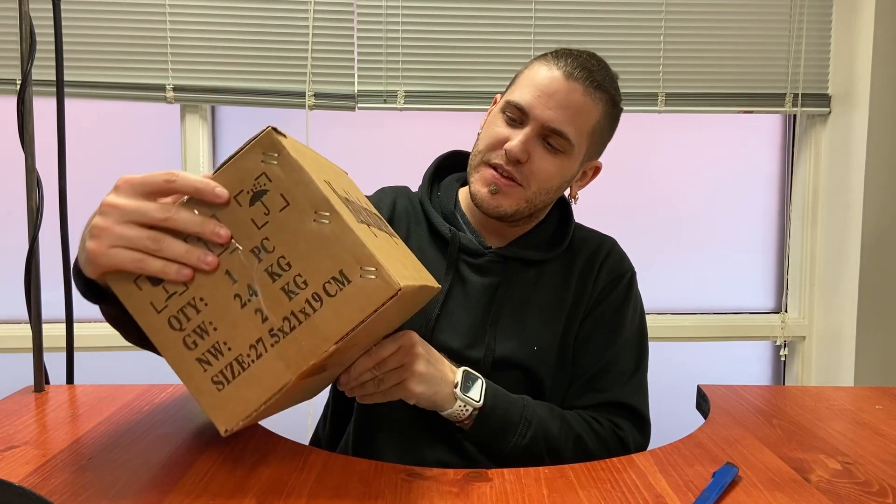Hey guys, welcome to another video. Today we're going to be looking at this very on-the-nose label box. This is a magnetic stirrer.